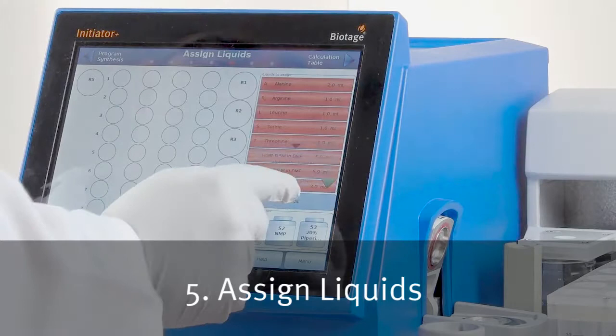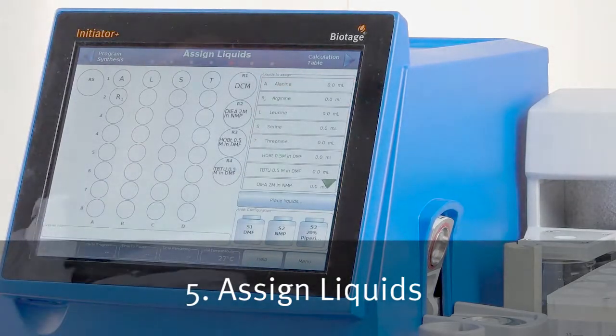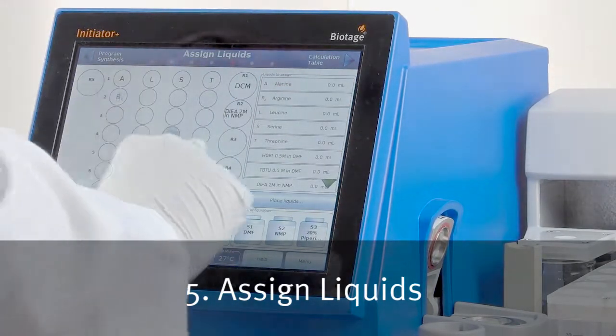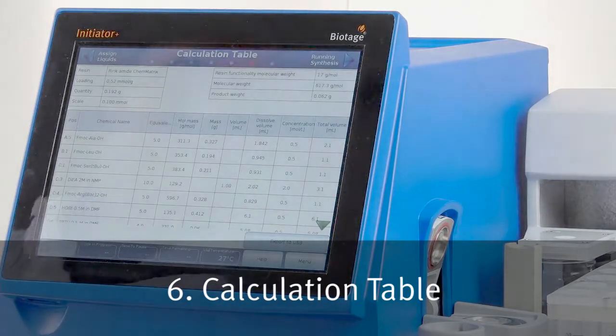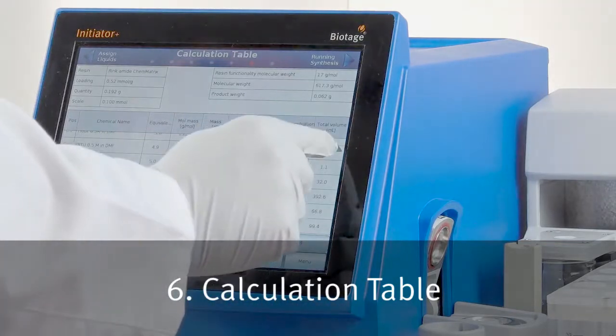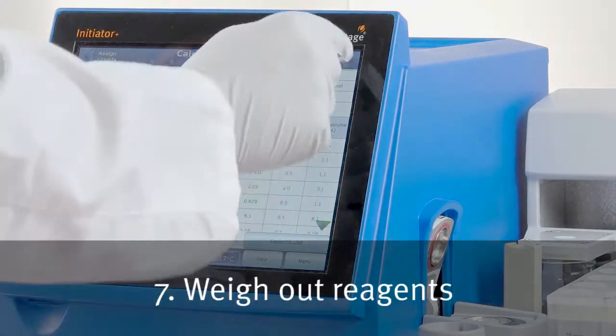Place the liquids wherever you like using the drag and drop touchscreen. The calculation table shows the weights and volumes of all reagents required and can be exported as a PDF file.